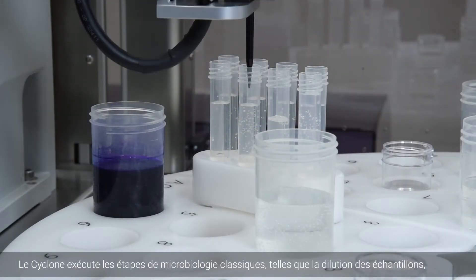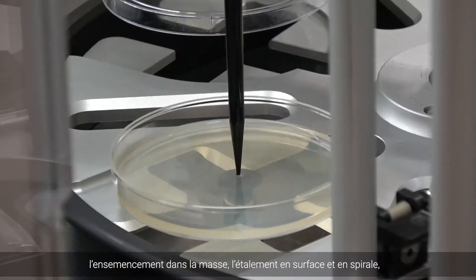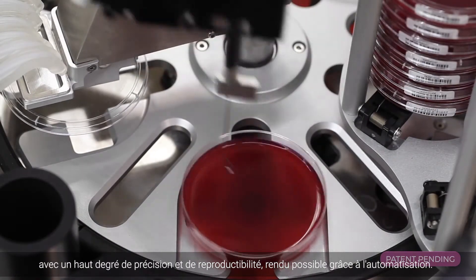Cyclone performs classic microbiology techniques such as sample diluting, pour plating, spiral plating and spread plating with a high degree of precision and reproducibility, only possible with automation.